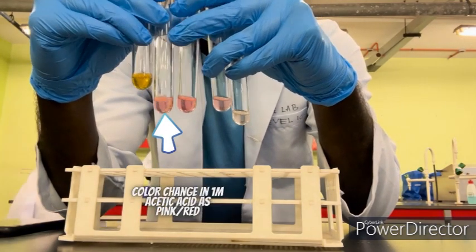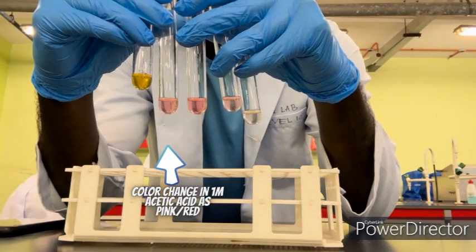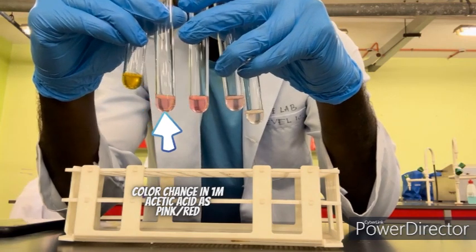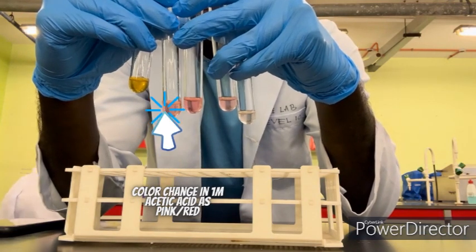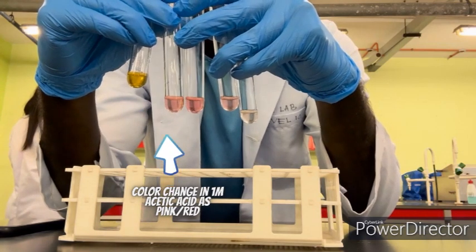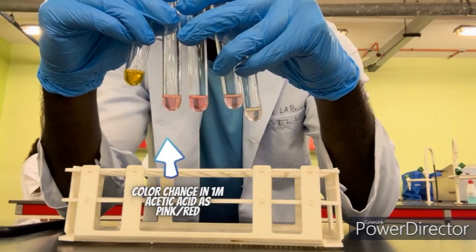Okay, and this one is acetic acid 1M. Okay, we can see there is a color change too. So we can see here for the HCl and also for the acetic acid 1M. Okay, there is not much difference here. We can see there is almost the same color.